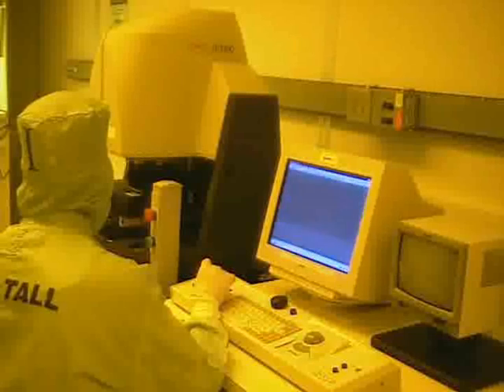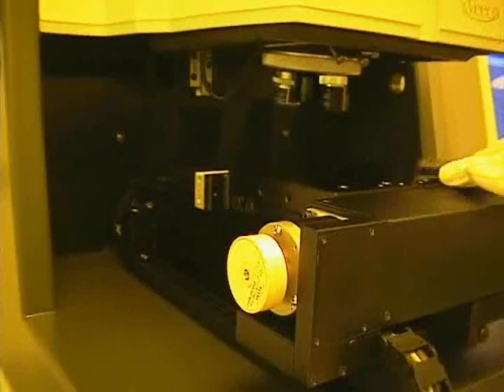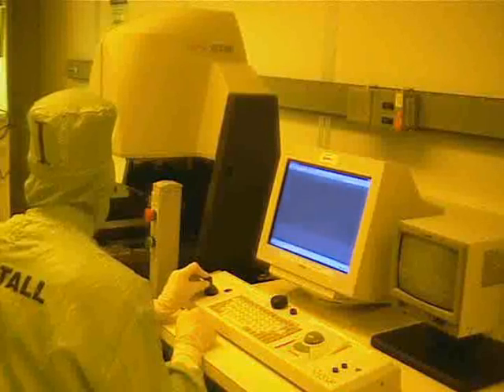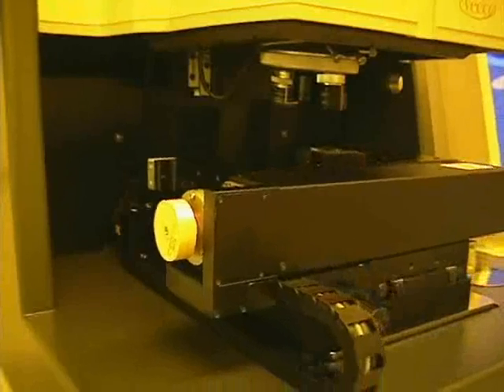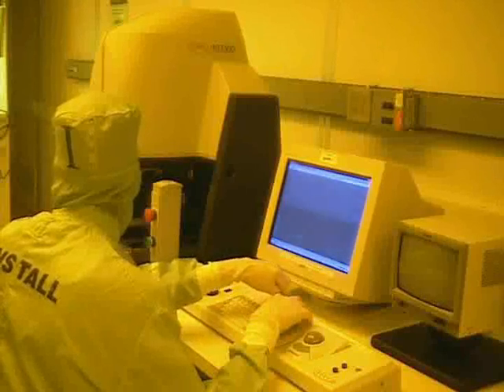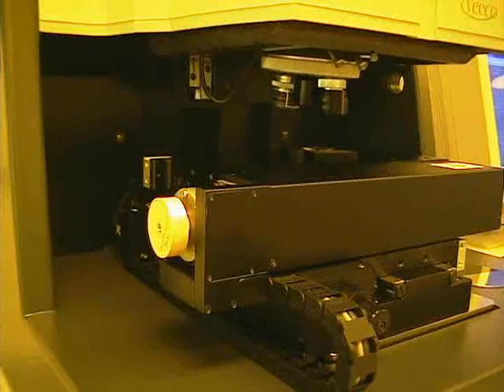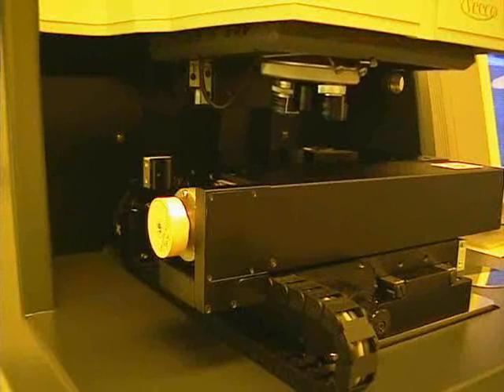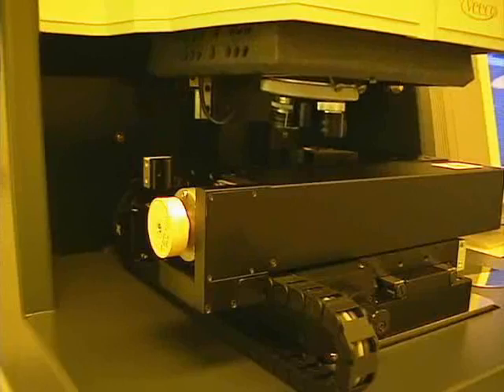We load the sample by pressing up on the joystick in order to bring the stage out. We place the sample on the stage, then move the stage in by pressing down on the joystick. We want to position the sample directly under the objective. We then lower the objective by rotating the focus knob to the left and pressing the fast button. You want to lower the objective lens until it is about half a centimeter away from the sample.